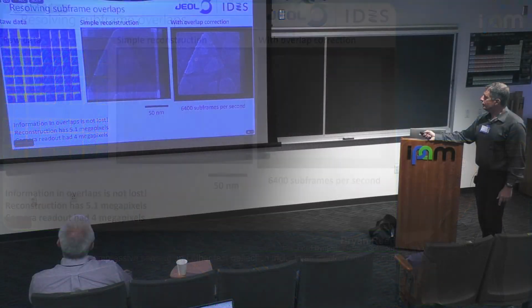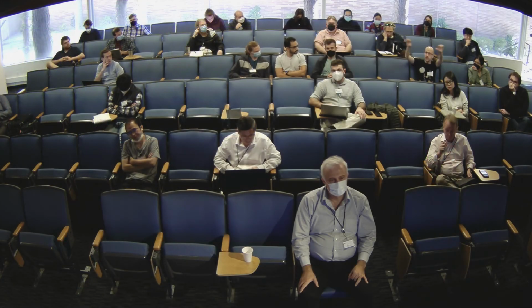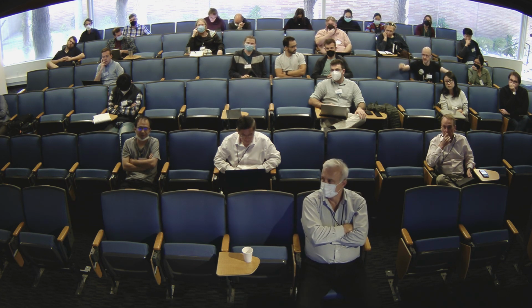And if you look close, you can see there are still some artifacts. But I mean, it does a pretty good job, I think. Yeah. It does look good. One question: in the overlap areas where it's jumping back and forth, could you instead just use the most recent available frame for a prediction of what it should look like? I can do that, and a variant in the algorithm allows me to do that. But I prefer to only show stuff that I have direct knowledge of rather than interpolating.